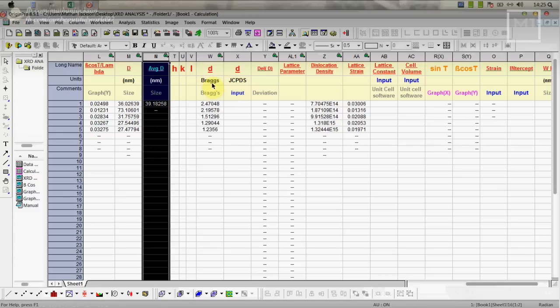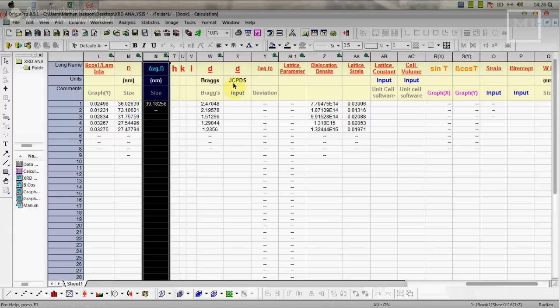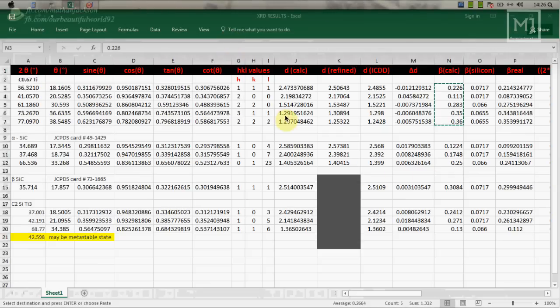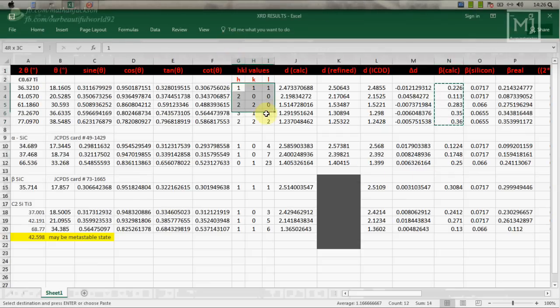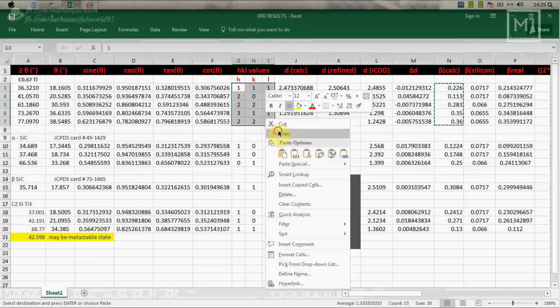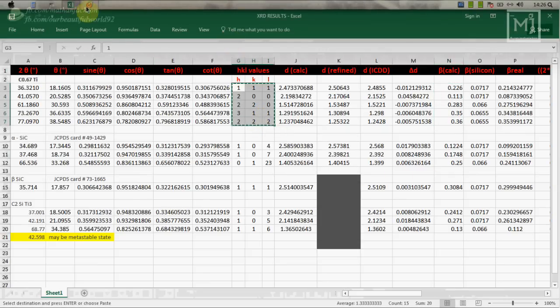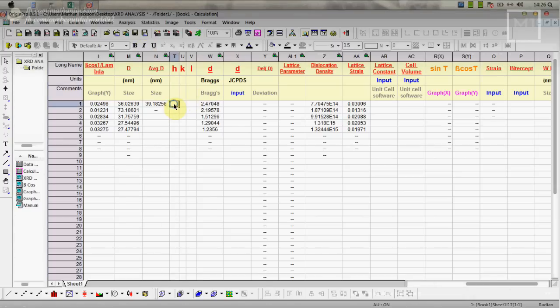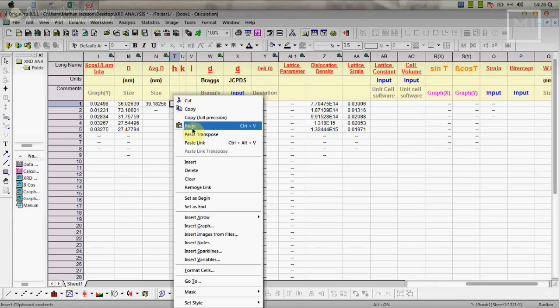In this case here it is five peaks. Next thing, D Bragg. This D is basically obtained from n lambda equals 2d sine theta, that value. Through the JCPDS data we obtain this HKL values and at the same time we'll obtain this JCPDS D. For example here we got the HKL value, so I am copying this and pasting here.